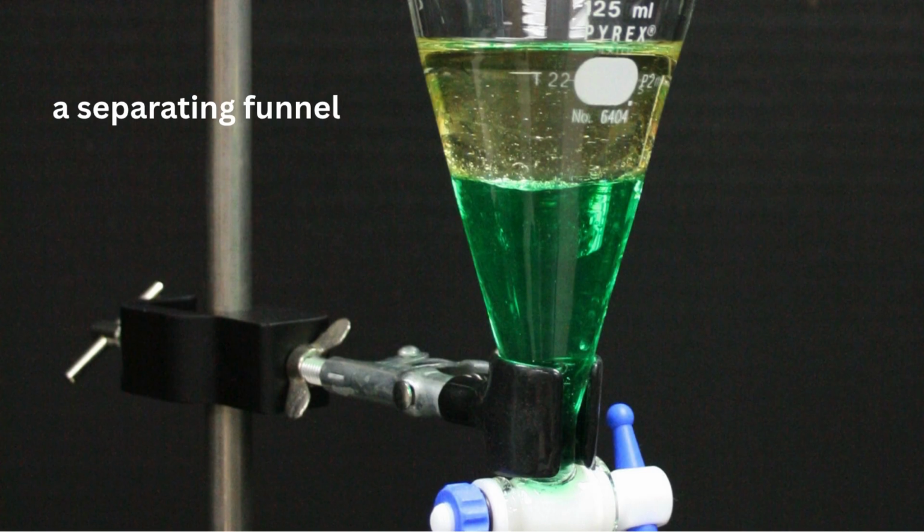We separate these liquids using a separating funnel by opening the separating funnel. You open the tap and you will collect the lower liquid in a container, and then when it's over, you close the tap.